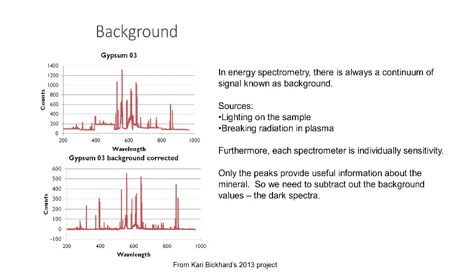In all of the techniques we're discussing today, we are measuring energies or wavelengths through spectrometry. And what we're interested in is the high-intensity radiations that are produced over limited ranges of wavelengths or energies. These are peaks. But part and parcel to the technique is radiation that's being caused in between the peaks.